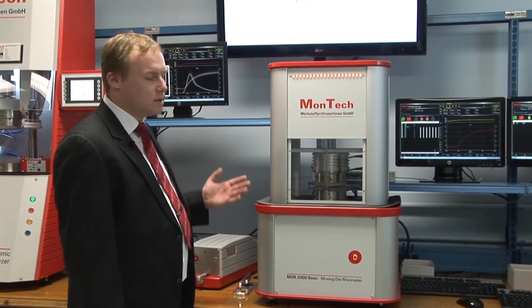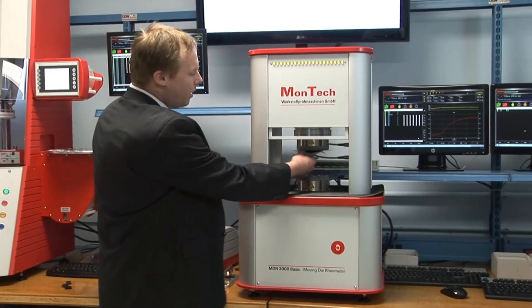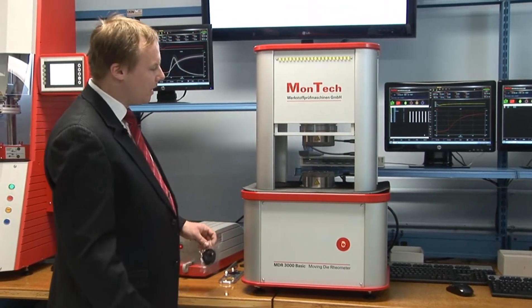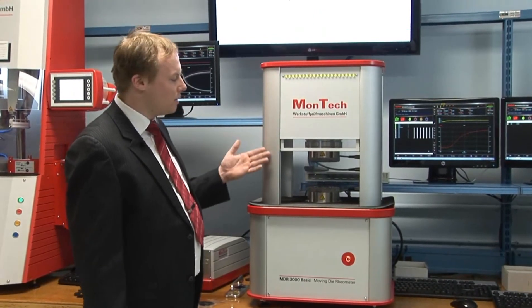Once the test is finished, the platens open and the shield automatically opens. On an instrument without an automation system you have to remove the sample manually. As you can see, the status bar is now green, meaning the instrument is directly ready for the next test.